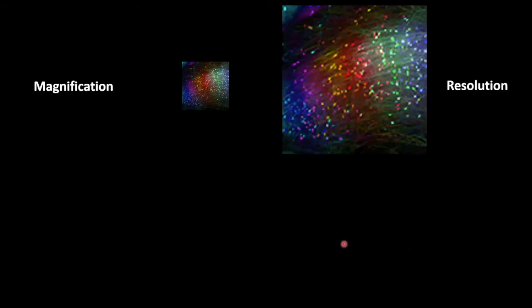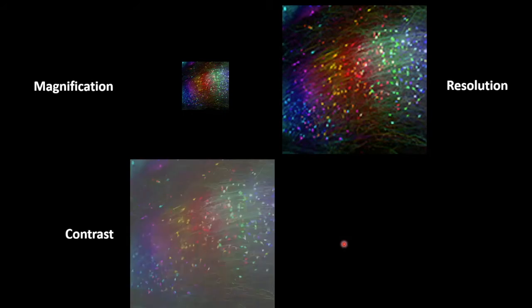For any good image, it should have enough information. First of all is magnification, where we have objectives with different magnifications, which is how large you can see the image. If it's too small, you can't see very well. The second one is resolution. If the resolution is too low, you're not going to see any detail. Even if you can see this picture larger than the previous one, the resolution is low, so it looks really blurry.